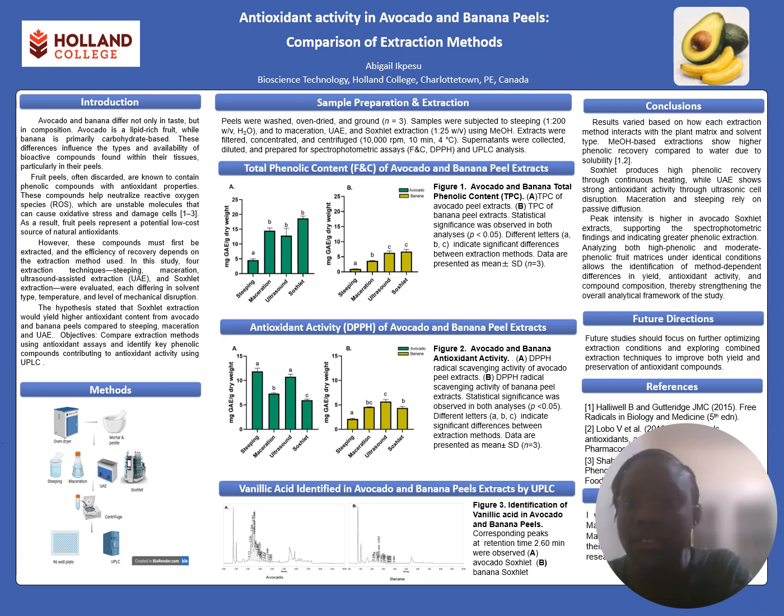The results varied based on how each extraction method interacts with the plant matrix and solvent type. And we can see that the methanol-based extraction showed higher phenolic extraction than the water-based, because steeping was done using water and maceration, ultrasound, and Soxhlet were done using the methanol solvent.